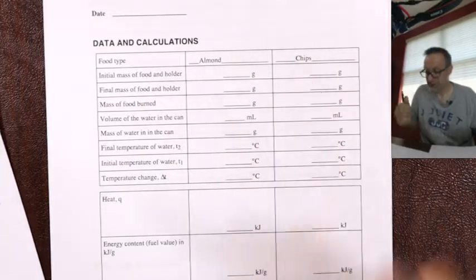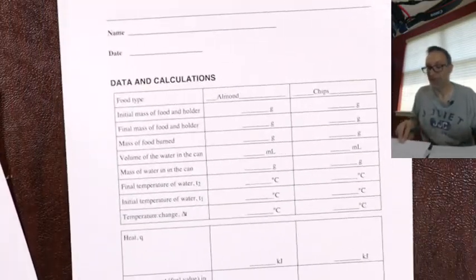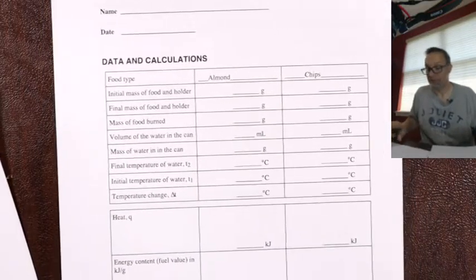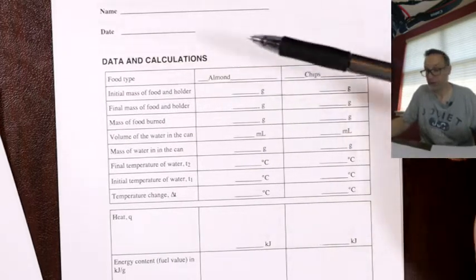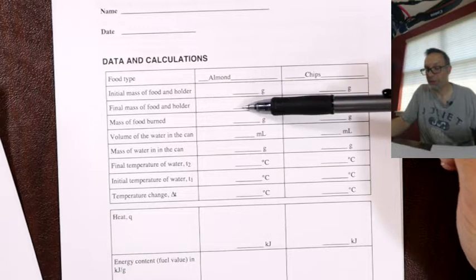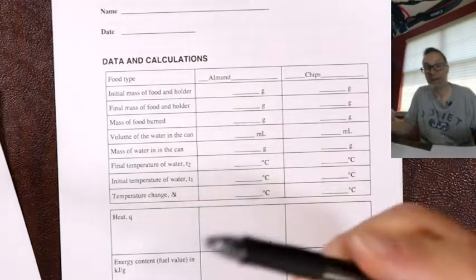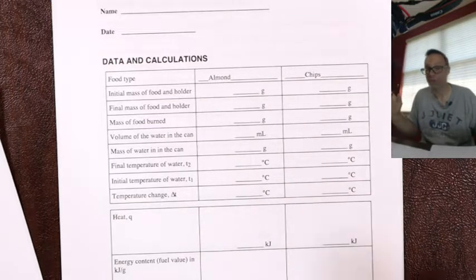Okay, so almond chips, peanut, pistachios, you can do the same technique every time. So maybe I'll run through it with you once for one of the foods. For almond, take the initial mass of the food and holder, and the final mass of the food and holder, subtract those and you'll get the mass of the food burnt. That'll be a small number, maybe 0.10 something grams.